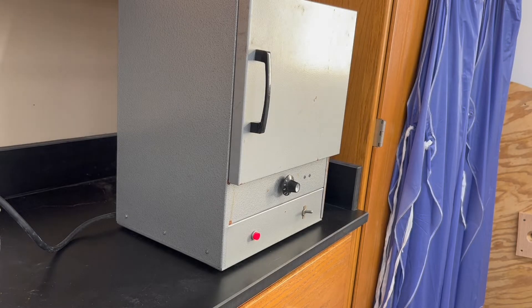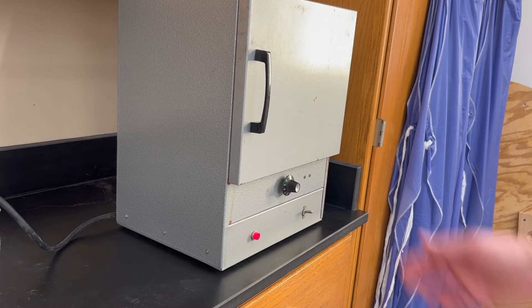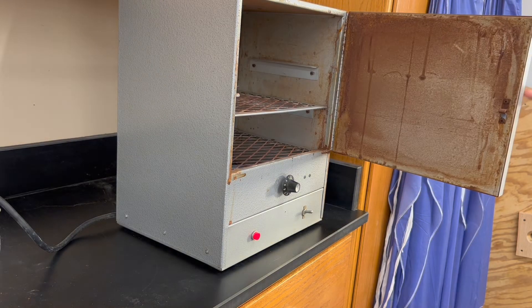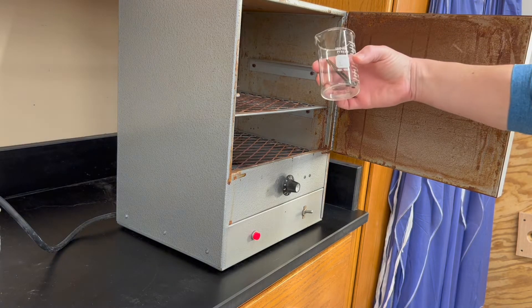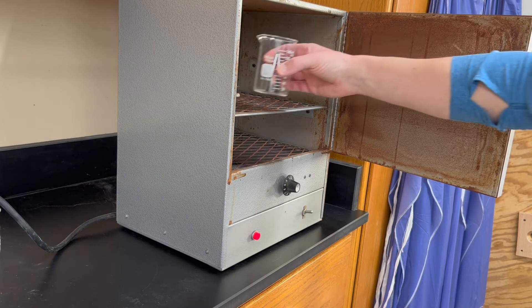This is the drying oven. It should be turned on and warm inside by the time you're doing the investigation. There will probably be other beakers inside already drying, and you can just place your iron nails inside.